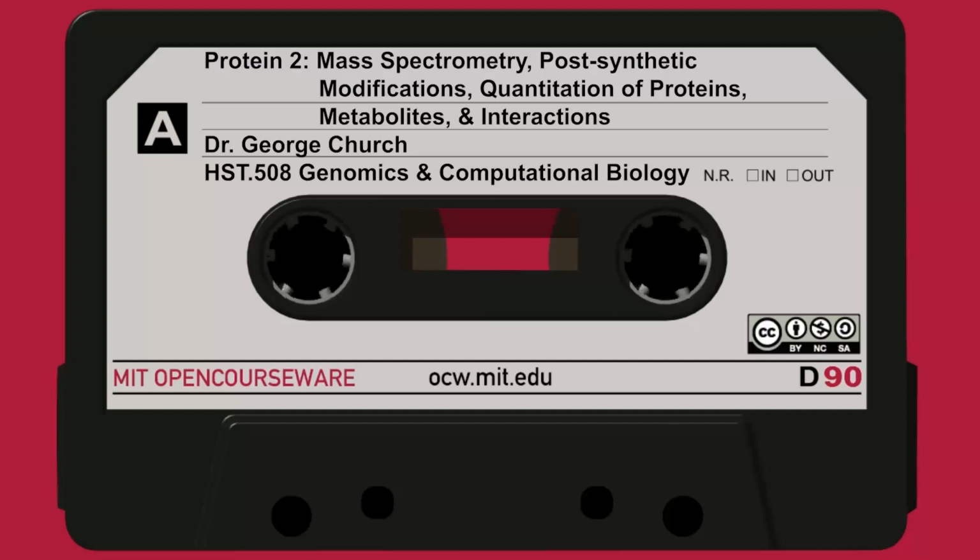Now, unfortunately, not all peptides are equal in their ionization potential. And so if it ionizes poorly, you won't detect a particular peptide from a protein. If you detect a large number of peptides from a protein, that probably means that it's abundant in your sample or your fraction. And it also means that you can believe that the computer identification of that protein is probably pretty solid. So if you get 5 or more peptides from a particular protein in your database search, and we'll talk in just a moment about how you do that database search, then you believe it, and it's very solid.